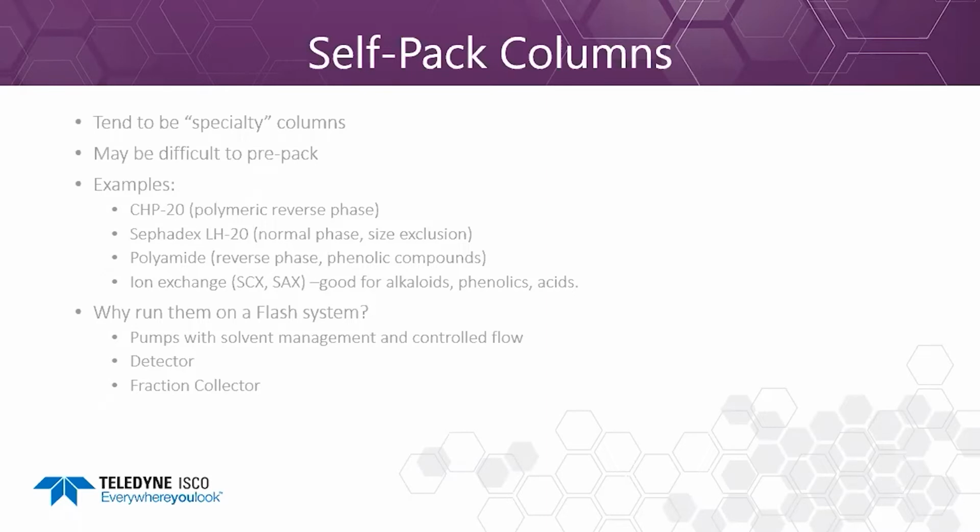Solvent management is important for these compounds. For instance, if you let a Sephadex column run dry, it makes cracks and you can't fix them. You can run isocratically. Sephadex swells up differently in different solvents, so you can't really run that as a gradient anyway. The next gen systems can run at a very low flow rate. So Sephadex is really good there. If you run them too fast, the Sephadex compresses, creates high back pressure, and eventually clogs. And like I said, you get a nice detector that lets you combine fractions.